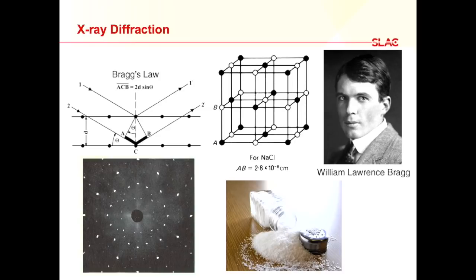The periodic nature of the material will cause a diffraction pattern on a detector that is also periodic. And then we can use this pattern to deduce that the structure of table salt is a crystal with this alternating pattern. That's sort of the first example of crystallography from a long time ago, from William Lawrence Bragg. And we call these peaks of intensity here Bragg peaks after him.